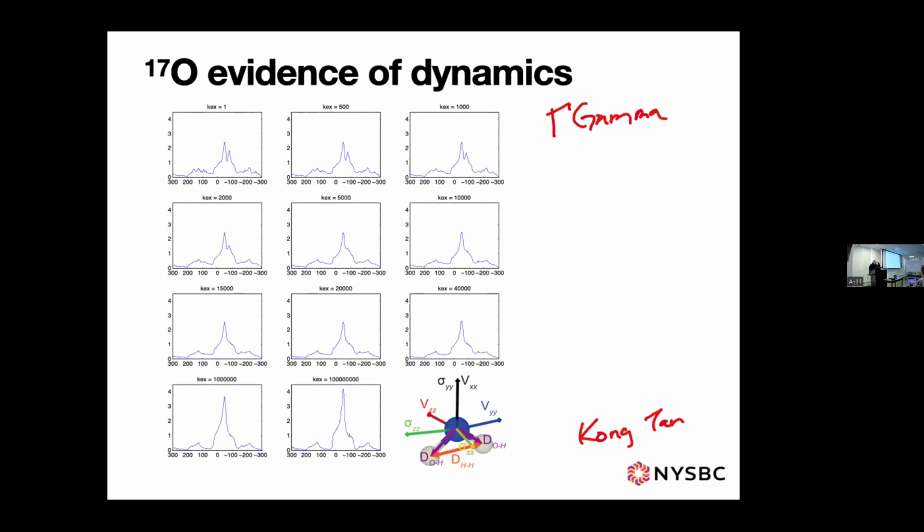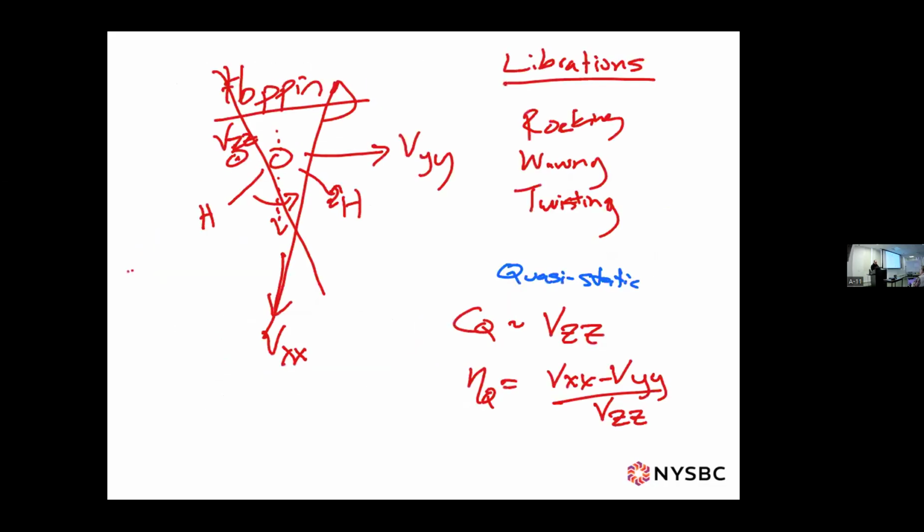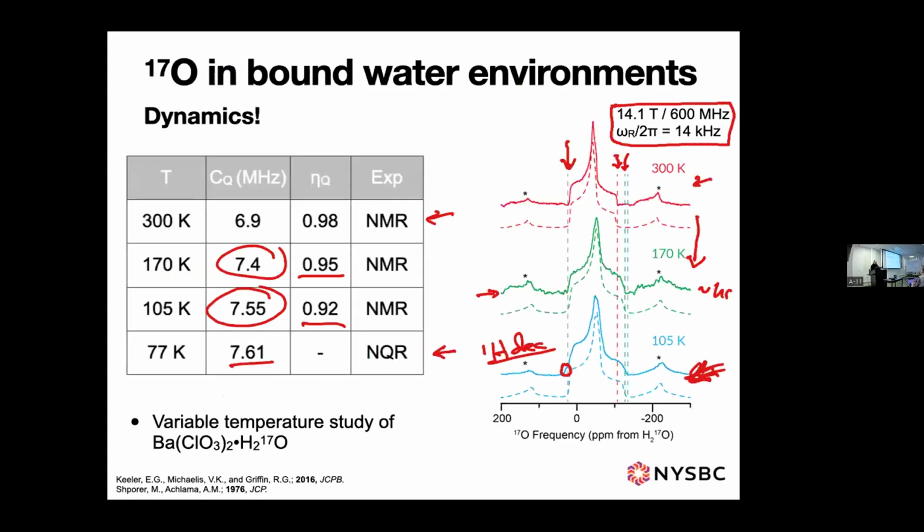So you can see as the exchange goes from essentially infinitely fast to one, you get the spectrum that we expected. Somewhere in the middle, you actually get a spectrum that looks fairly similar to the sort of discrepancies in the shape that you see as I go back, sorry.